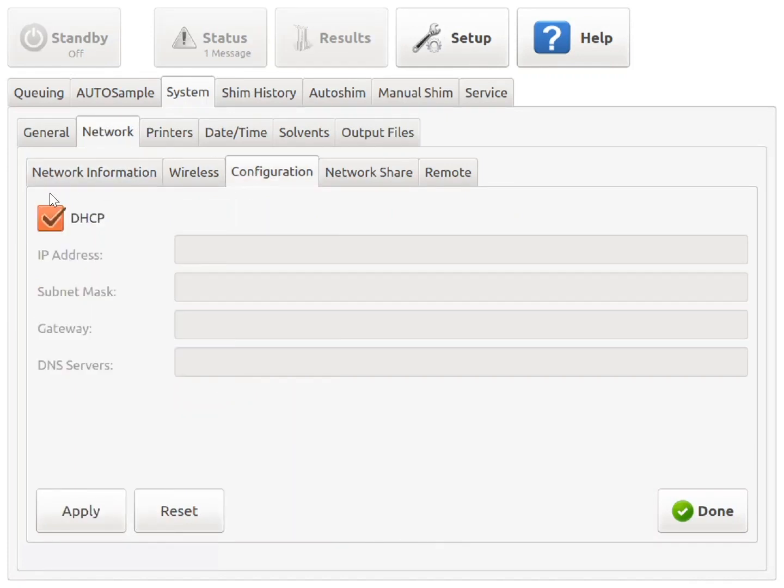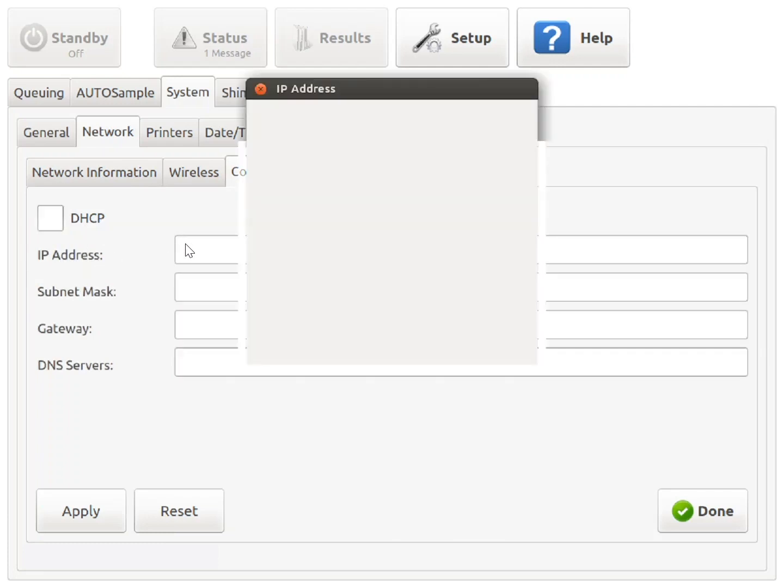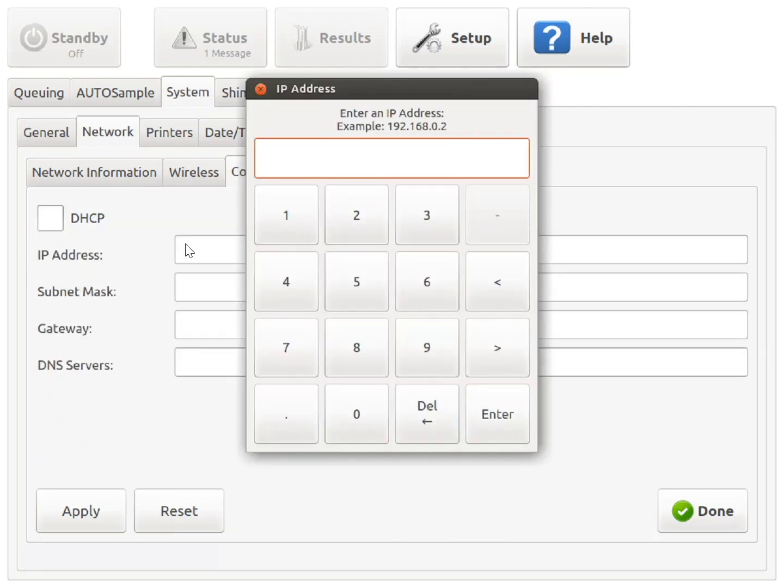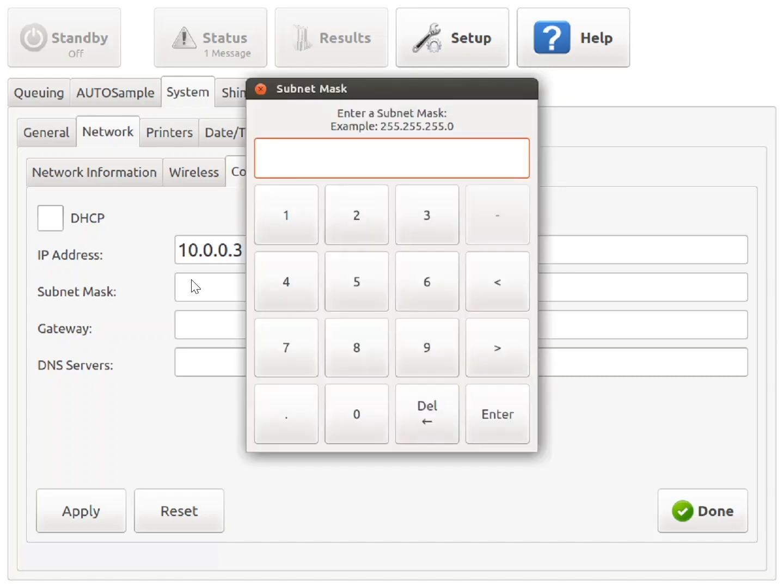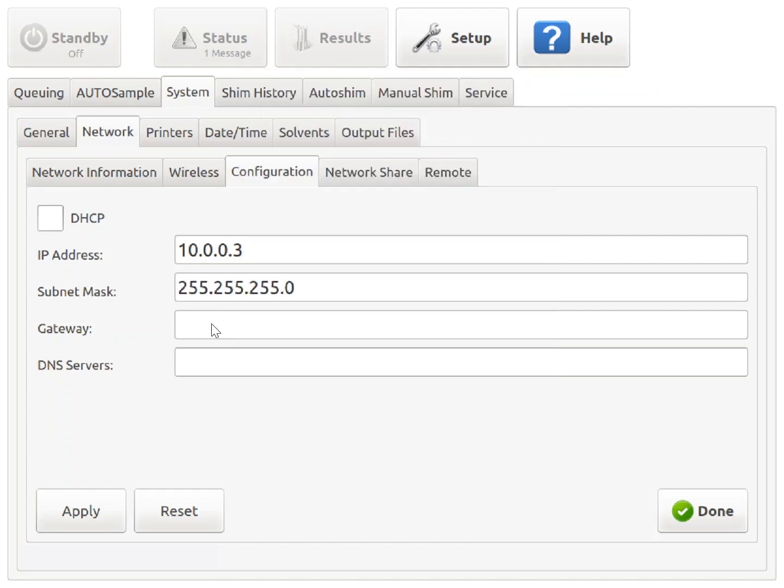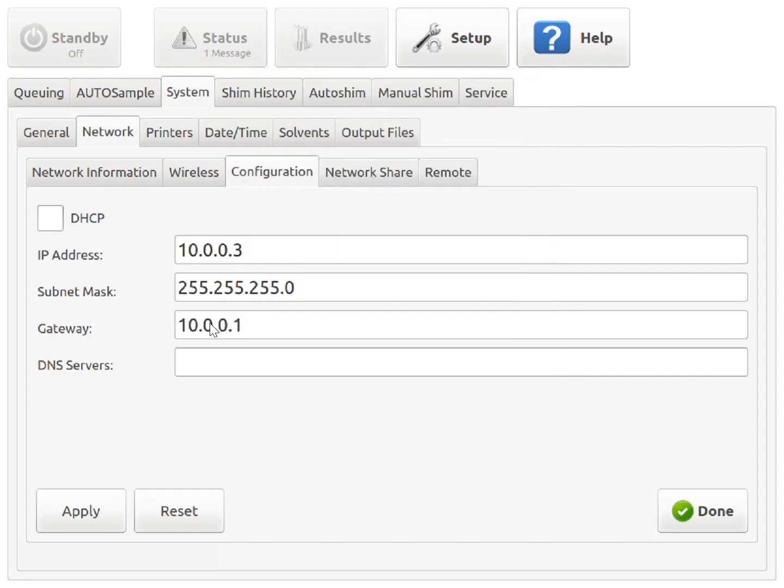Uncheck this DHCP box. Manually set the IP address to 10.0.0.3. The subnet mask as 255.255.255.0. The gateway to 10.0.0.1. And the DNS servers to 8.8.8.8.